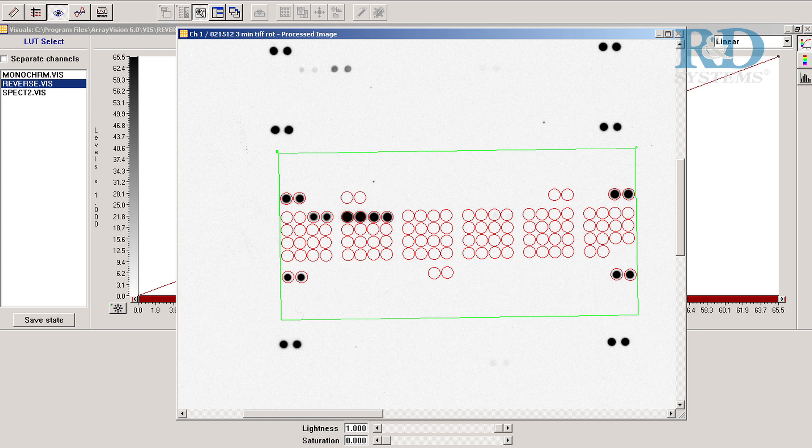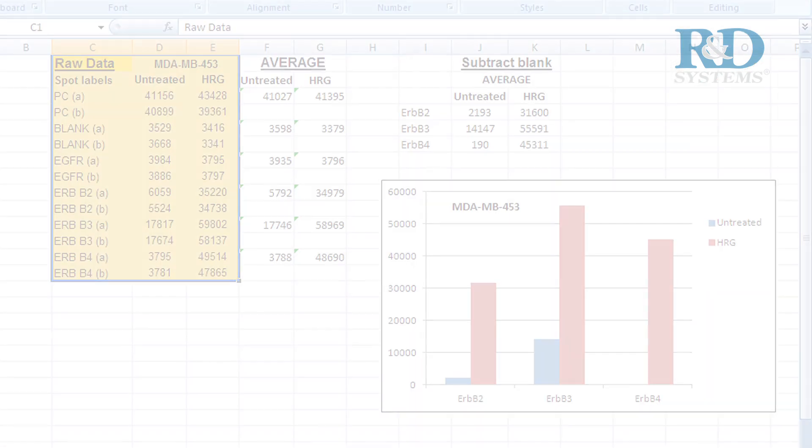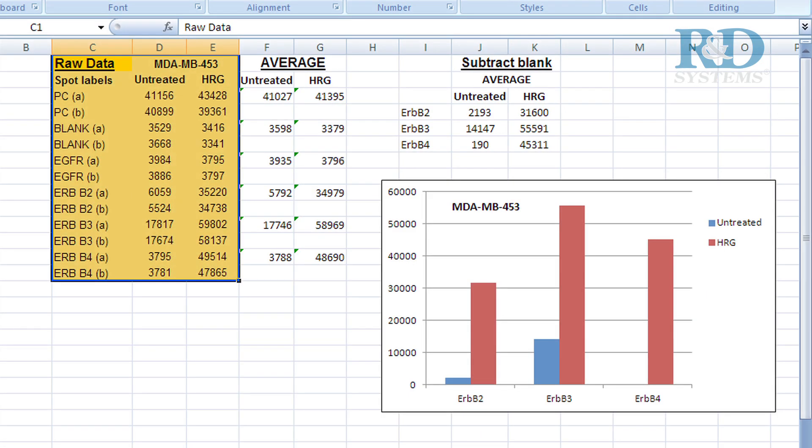Compatible programs can be found in the written protocol accompanying this video. Export signal values to a spreadsheet file for manipulation in a program such as Microsoft Excel.